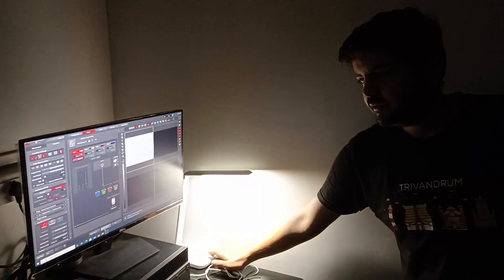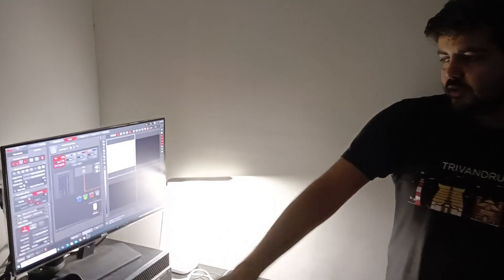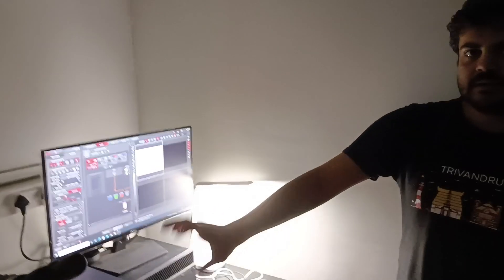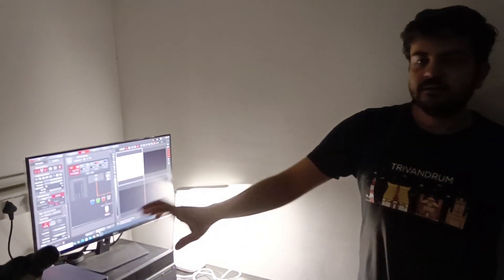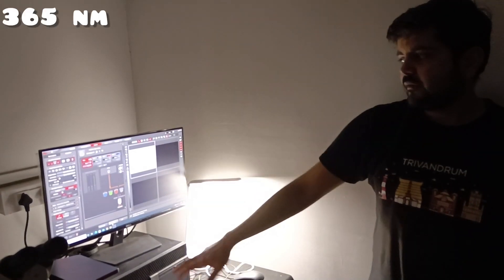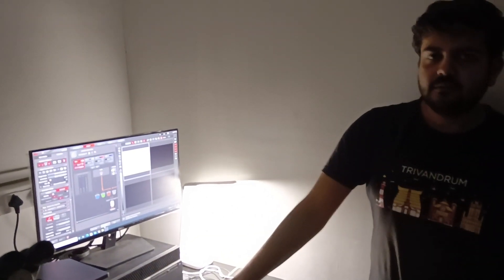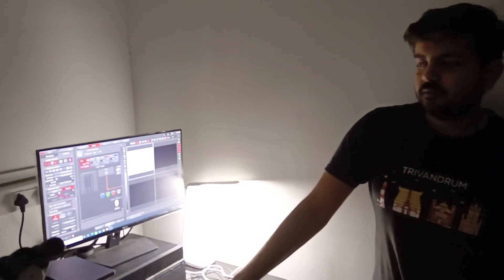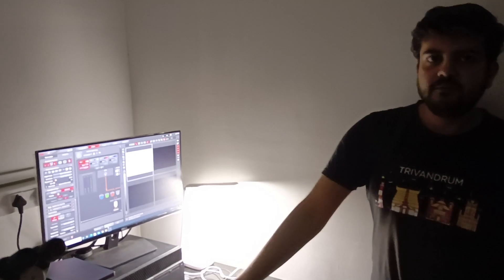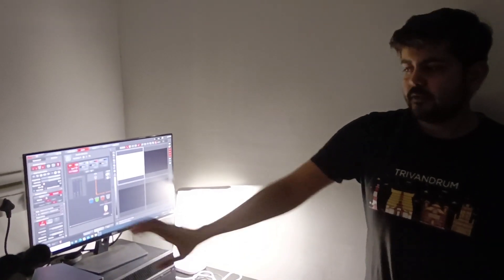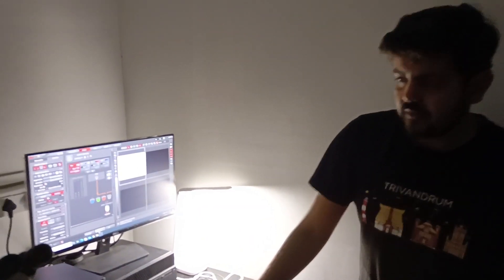This is how we actually do fluorescent imaging. What I just showed, basically three different channels, three different wavelengths, which are like 365, 460, and 550. Different fluorophores that we use, they are actually fluorescent in this range. Depending upon experiment, what fluorophore we are using, we can actually image them in different channels.